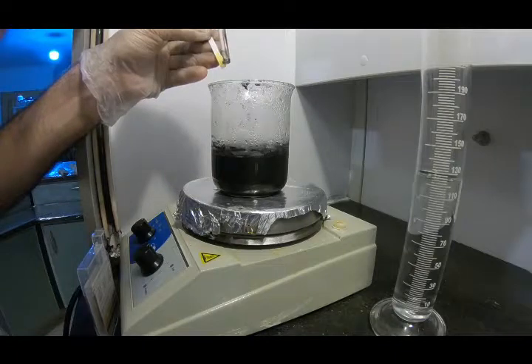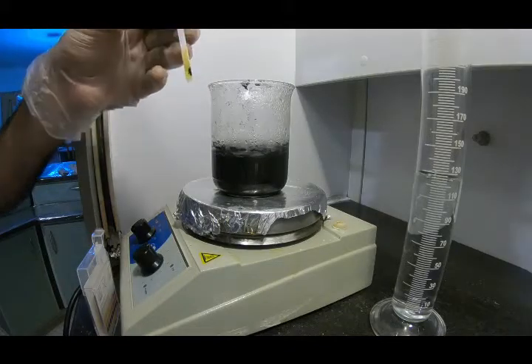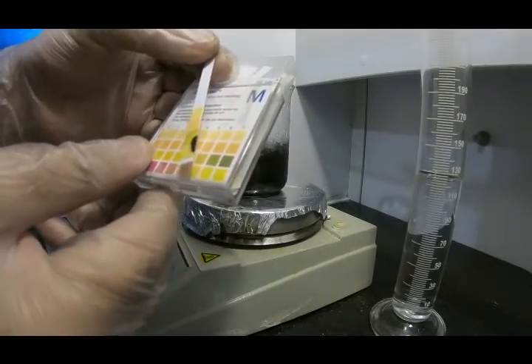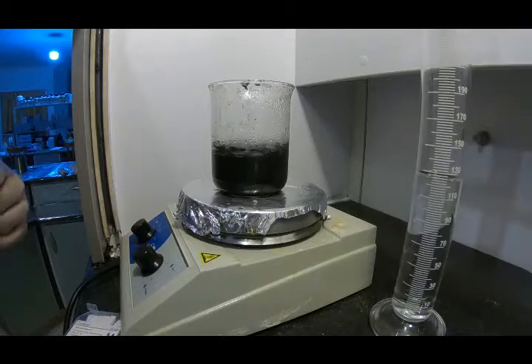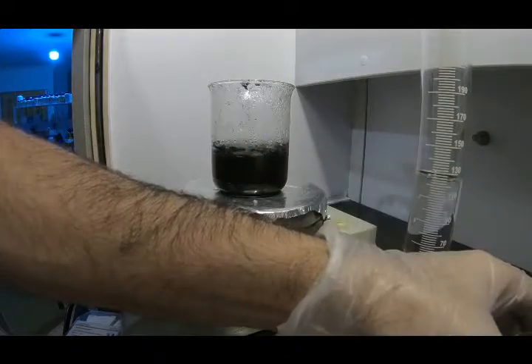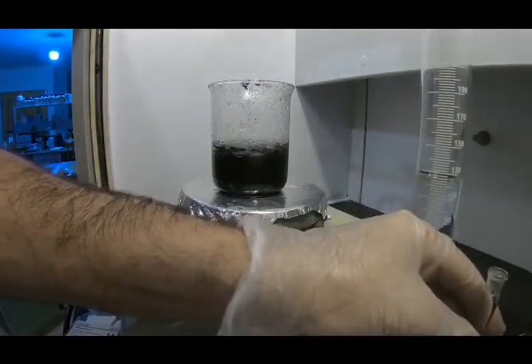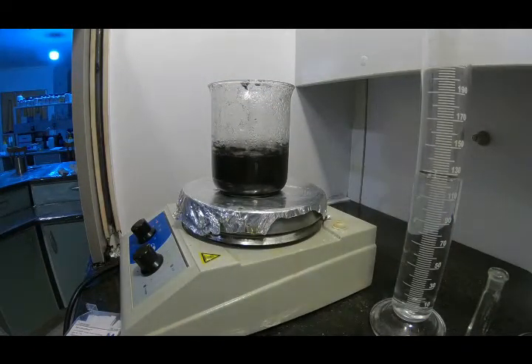Okay, let's check it. It is around maybe 7, so we can add a little bit more, just a little bit, not too much. Don't add too much, otherwise you have to reverse the whole process again. Just a little bit, not that much.